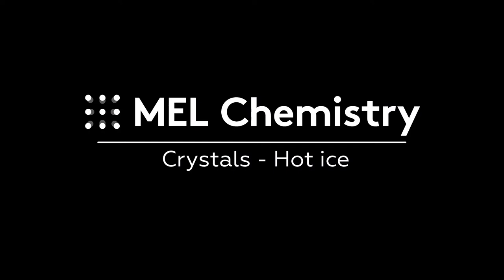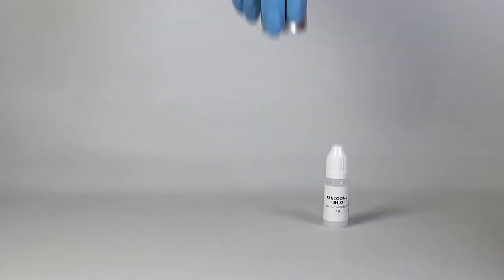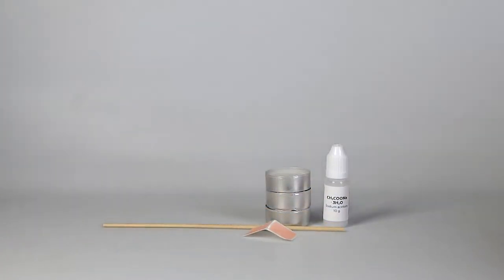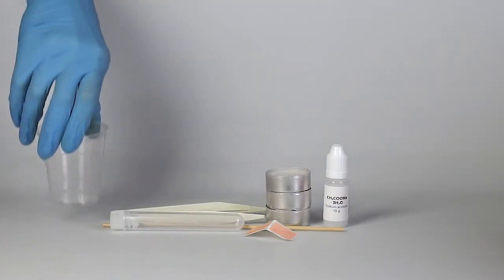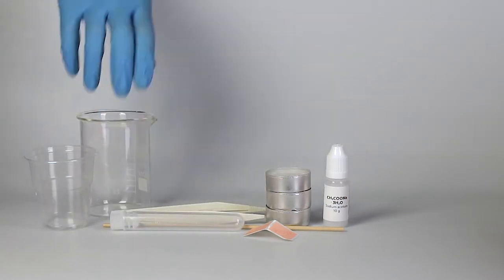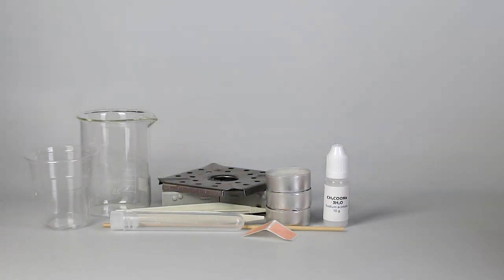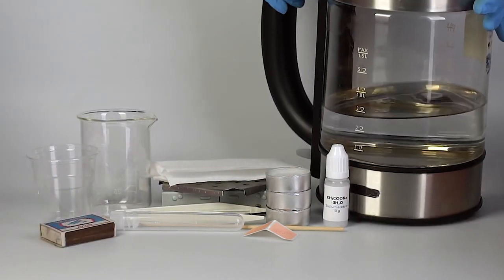For the hot ice experiment, you'll need sodium acetate, three candles, a thermochrome sticker, a splint, tweezers, and a plastic test tube. From the starter kit, take a disposable cup, a beaker, a solid fuel stove, and a flame diffuser. Also, prepare a paper towel, matches or a lighter, and a kettle of boiling water.